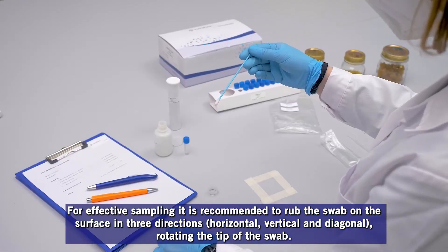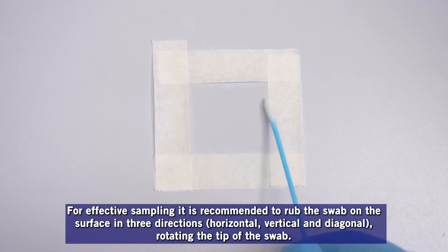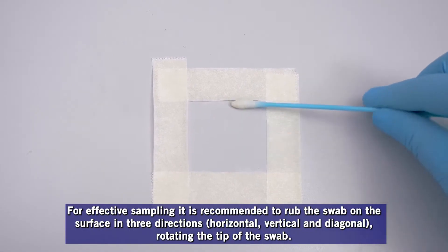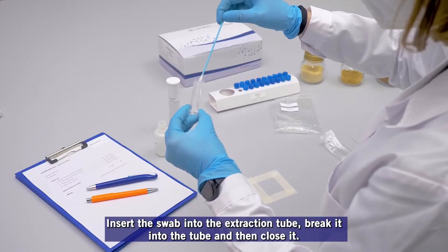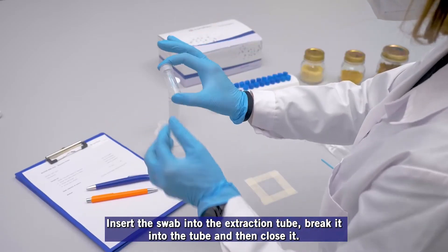For effective sampling, it is recommended to rub the swab on the surface in 3 directions: horizontal, vertical, and diagonal, rotating the tip of the swab. Insert the swab into the extraction tube, break it into the tube, and then close it.